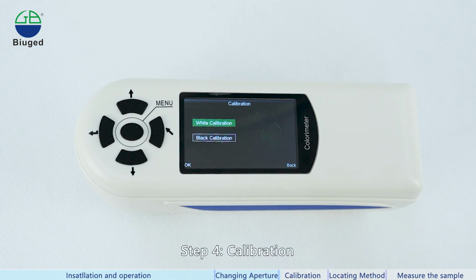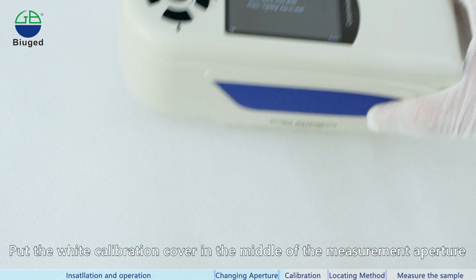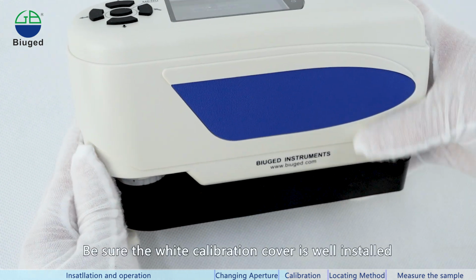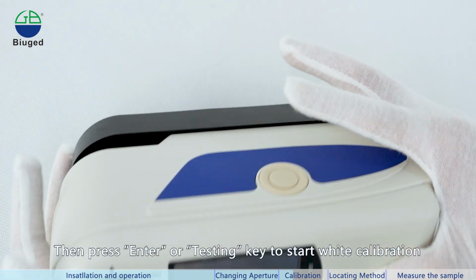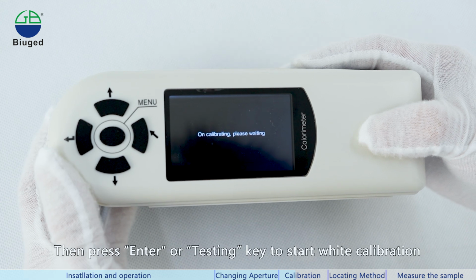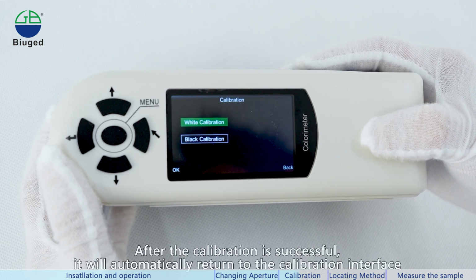Step 4. Calibration. Click the Enter button to enter the white calibration interface. Put the white calibration cover in the middle of the measurement aperture. Be sure the white calibration cover is well installed. Then press Enter or the testing key to start white calibration. After the calibration is successful, it will automatically return to the calibration interface.